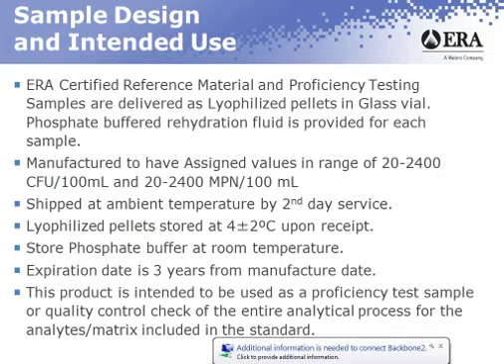I also wanted to mention the organisms that are used in ERA's wastewater product, just so that everybody is aware. The total fecal and E. coli analytes are accomplished with ERA using E. coli as our target organism in those samples. The specific culture collection that we use for that sample design is NCTC 11954. We've been using that for many years.